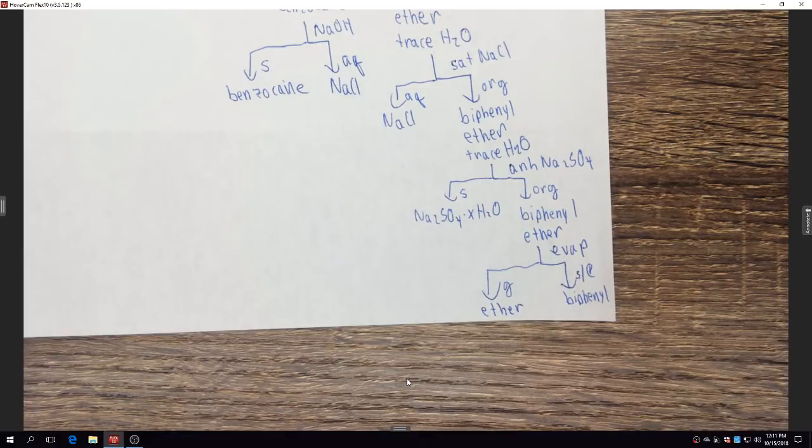All right. In all cases, with the exception of the sand, what are we going to do in order to try to prove that that molecule we isolated is that molecule we think it is? Melting point. So what you're going to want to do is go on Wikipedia or wherever and look up the melting points of all these things before you go to lab. Okay? So you want to have the melting points of all the compounds, and then you want to melt them.